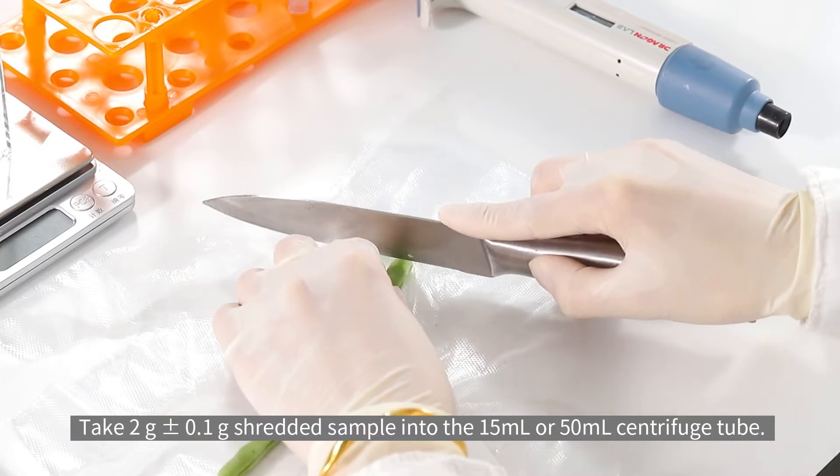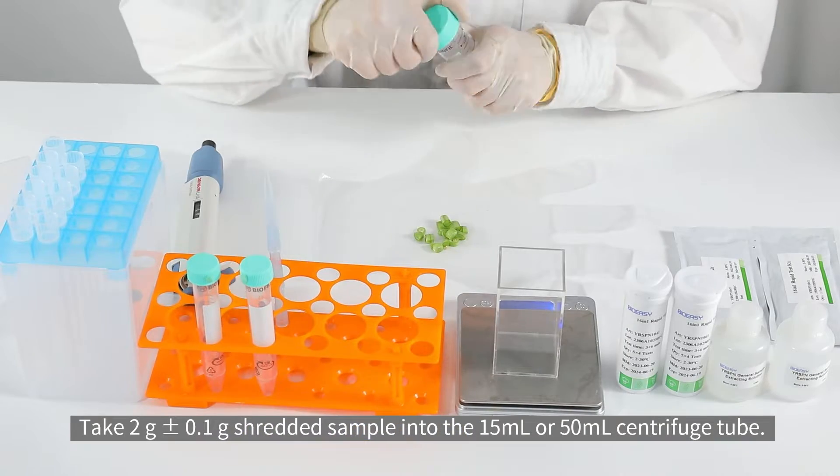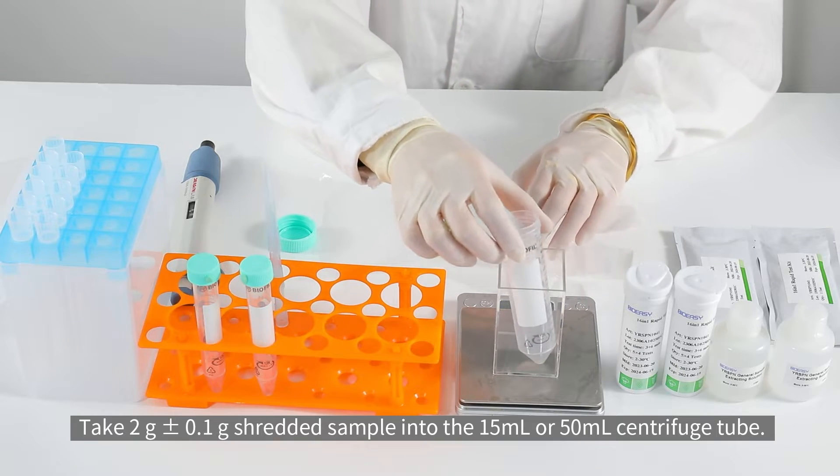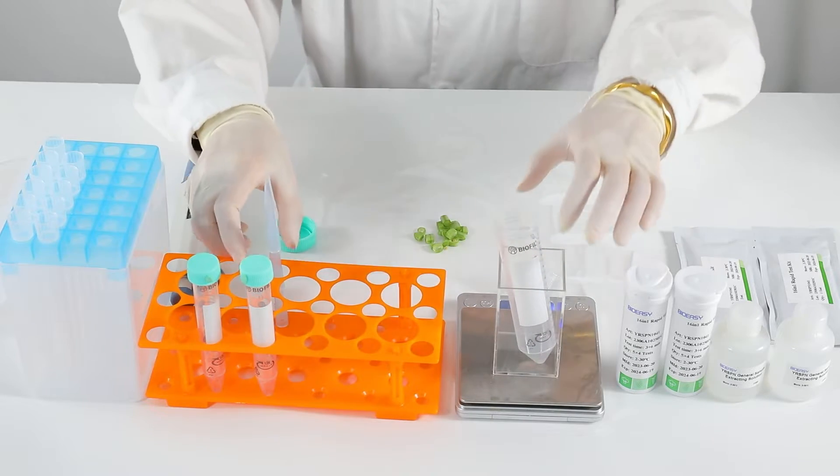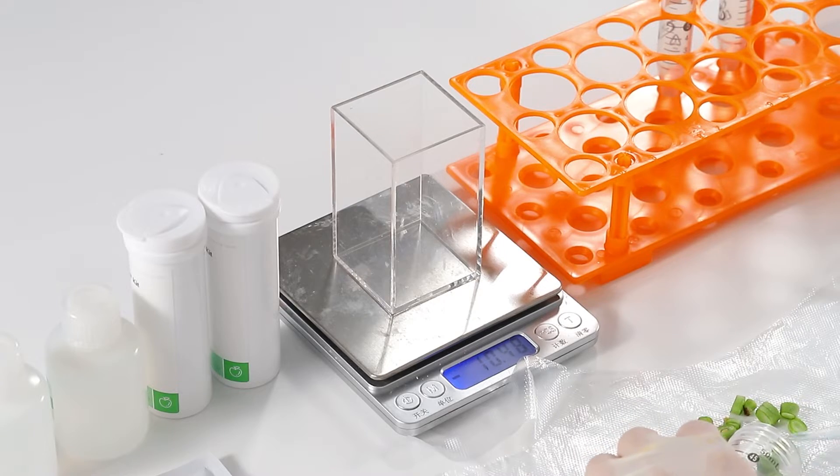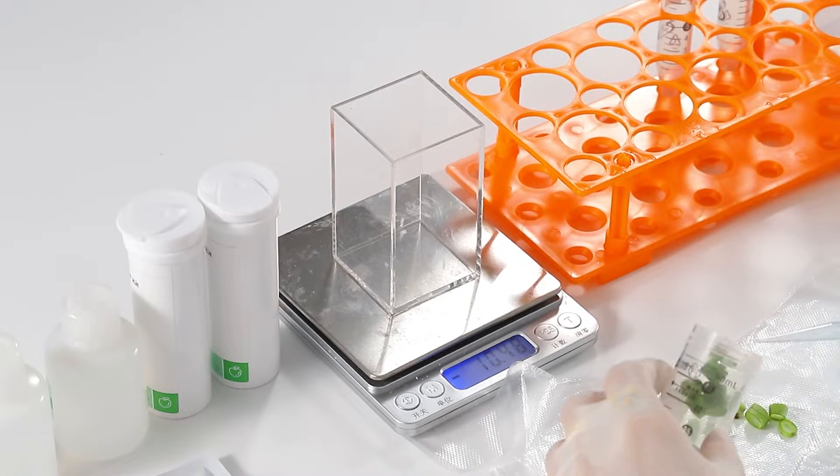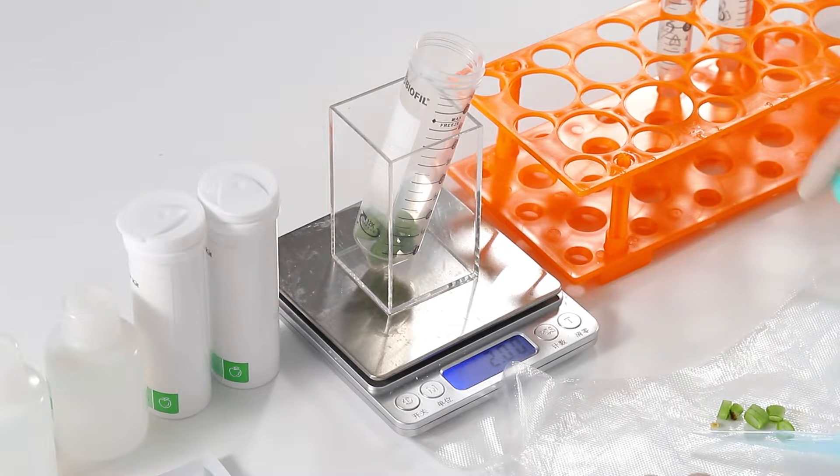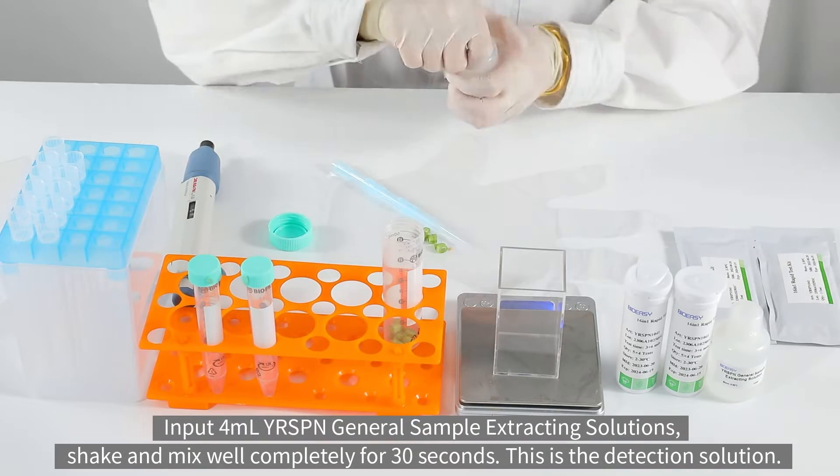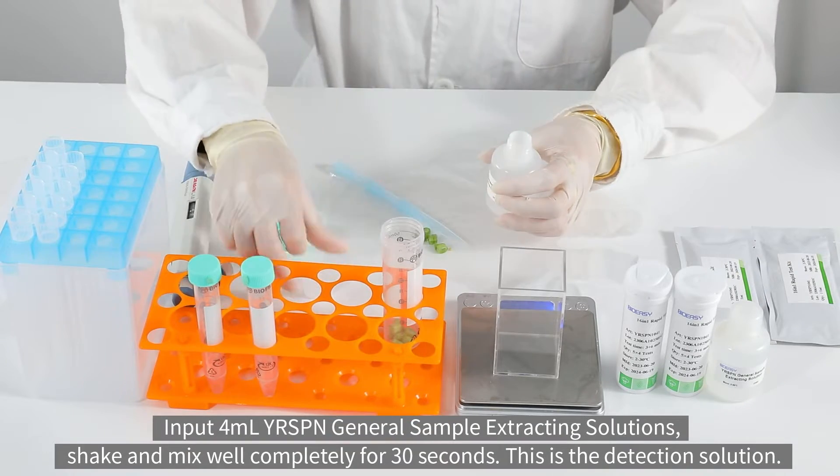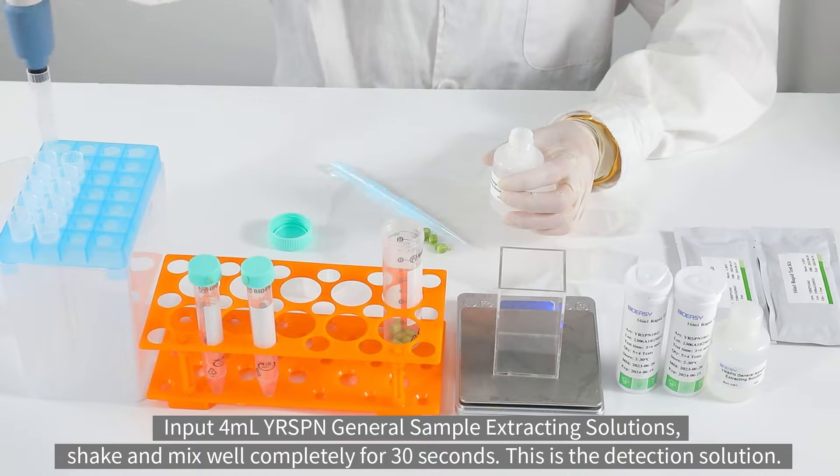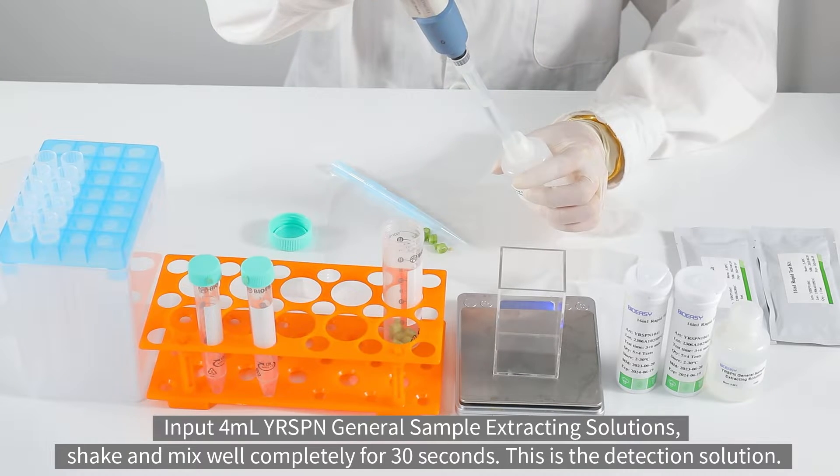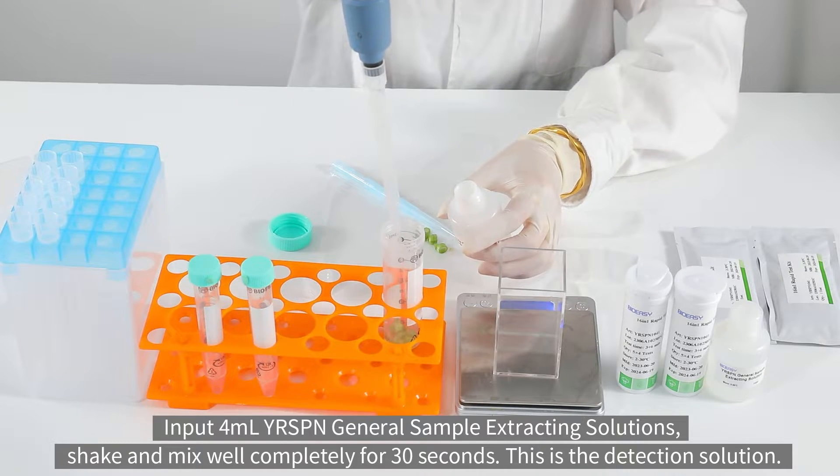Take 2g shredded sample into the 15ml or 50ml centrifuge tube. Input 4ml YRSPN General Sample Extracting Solutions. Shake and mix well completely for 30 seconds. This is the detection solution.